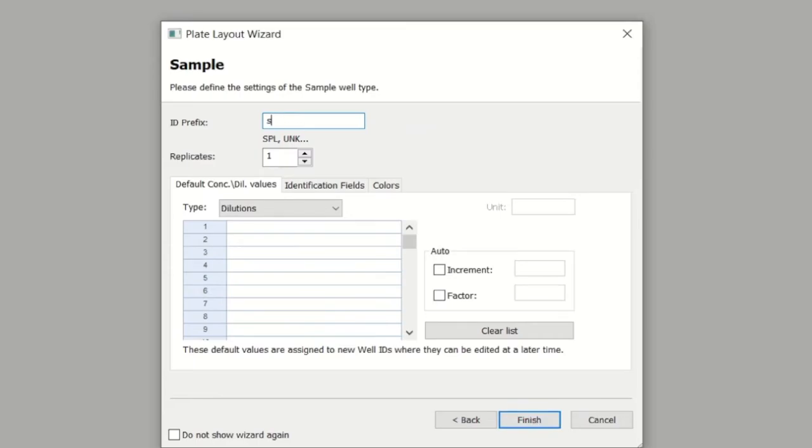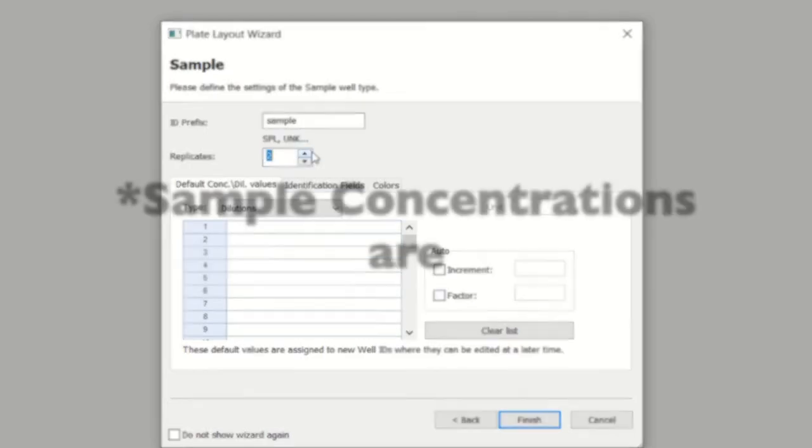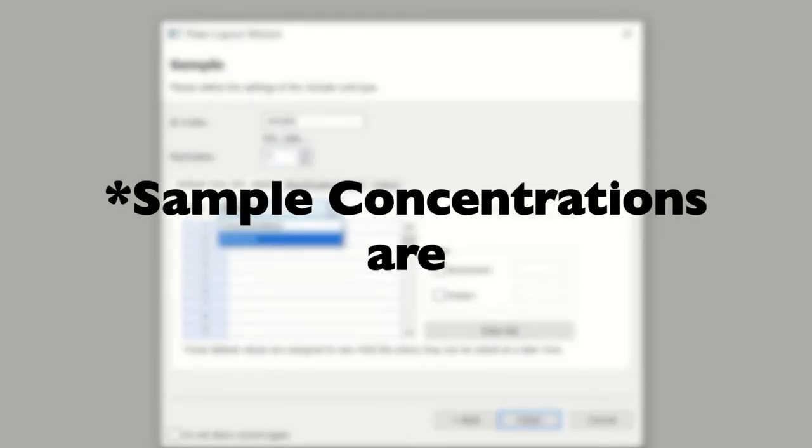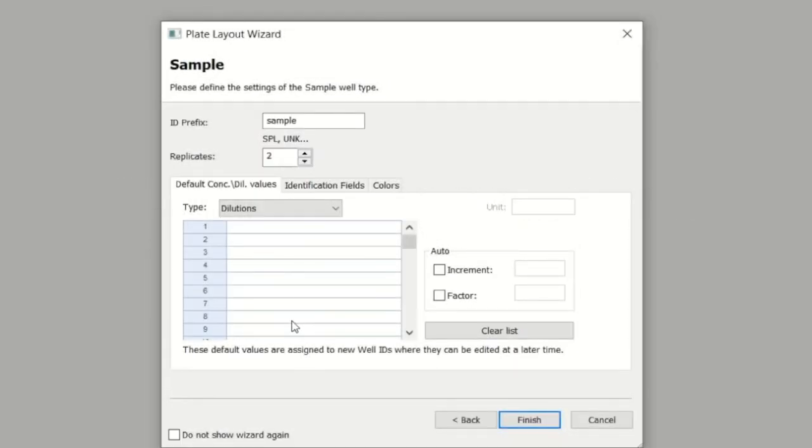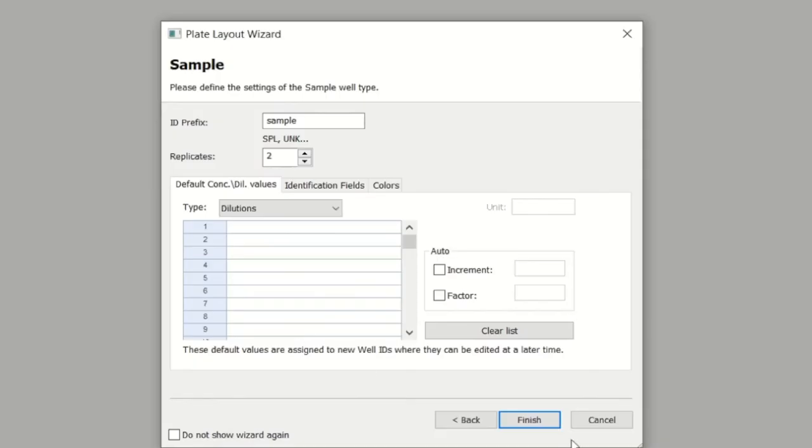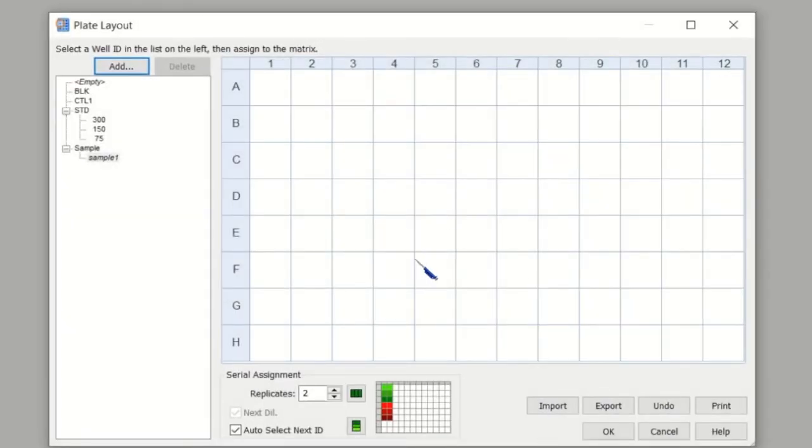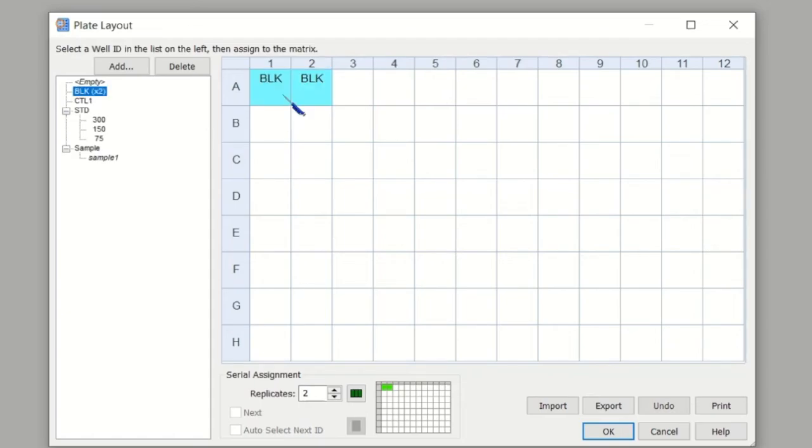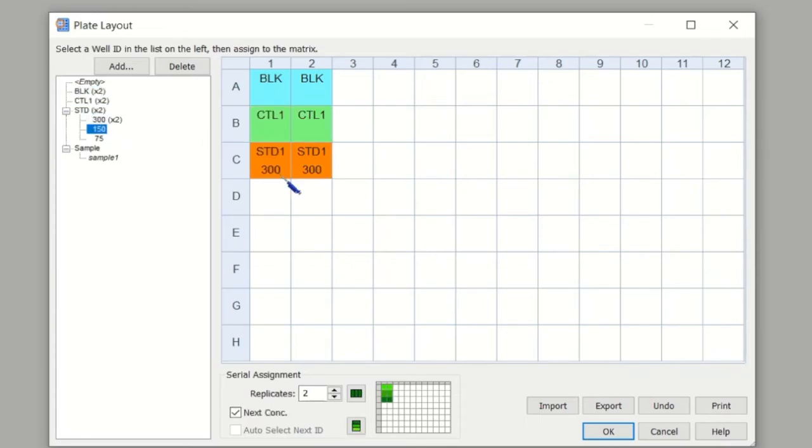Then it offers you the option to tell it what samples you've got. You can tell it the dilutions or concentrations that you're using, but often you don't know what your samples are, so you can just leave the bottom part unfilled and just indicate the number of replicates and move on. Indicate the sample control if you have one, then click Finish. That will allow you to now draw where everything is. By selecting blank, control, or standard, you can put in where it is on the plate because initially you're just saying these are the components I'm going to have, and now you tell it where it is on the plate.